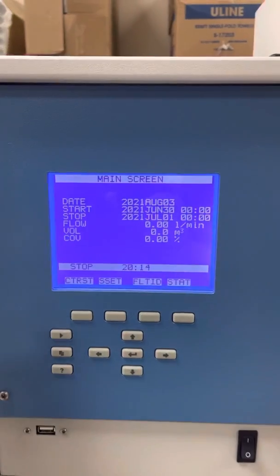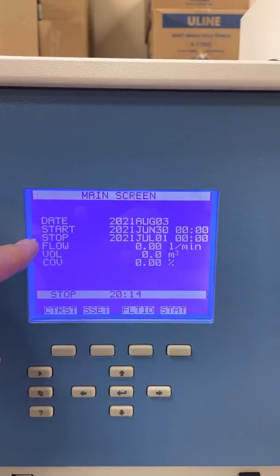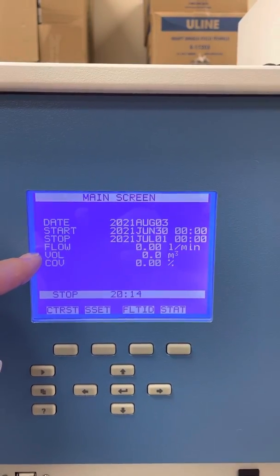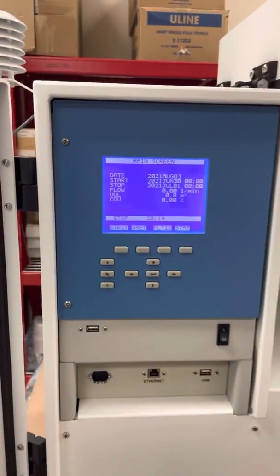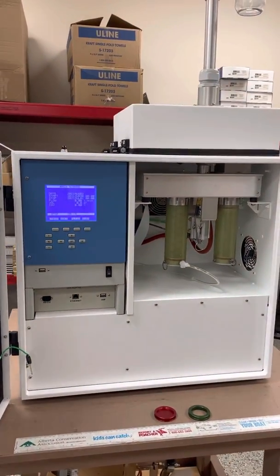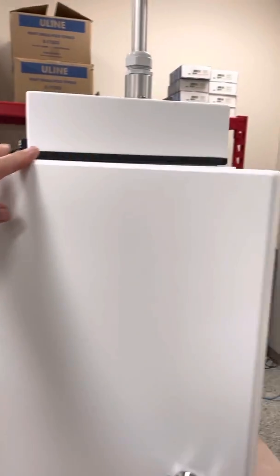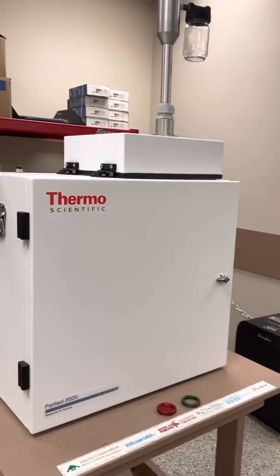Over here we have the start-stop date, just like the Partisol 2000i — you have your start date and stop date, and it will measure the flow and the volume. I'll go into that in another video. So this is the 2025i Sequential Air Sampler from Thermo Scientific. If you have any questions, feel free to comment. Thank you.